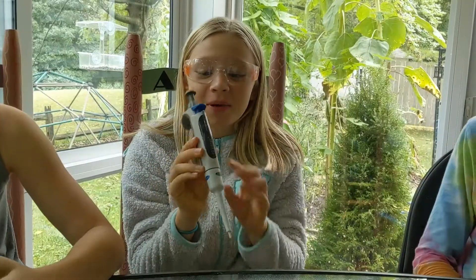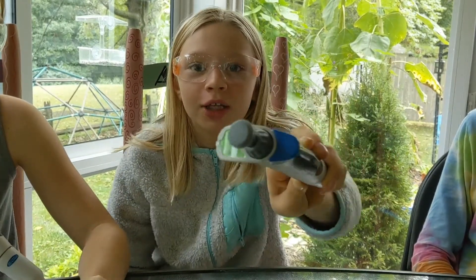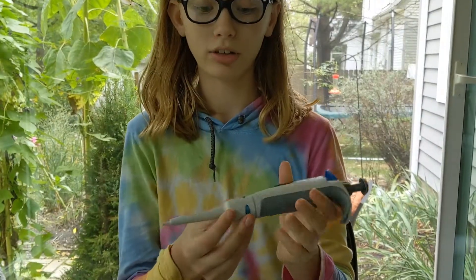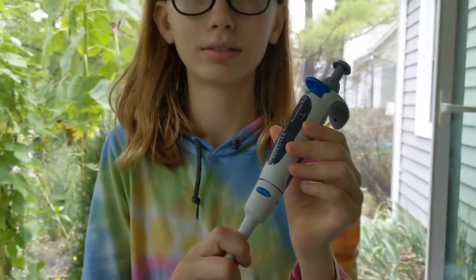Pro tip: micropipettes are very expensive so don't break them. Never go out of your range — if it says 0.5 don't go under, and if it says to 10 don't go over. You'd better not break them or you will be in big trouble.